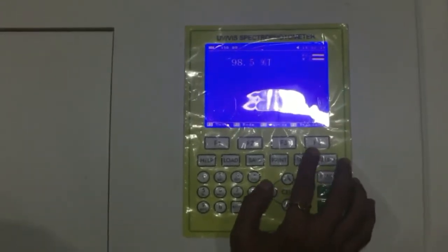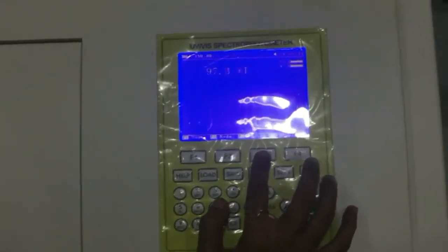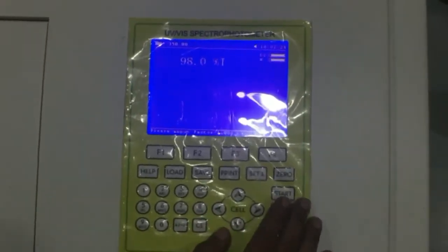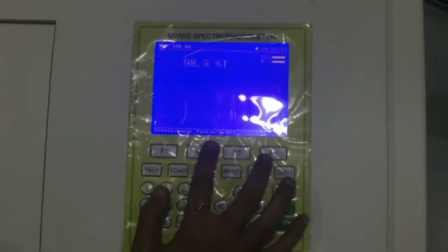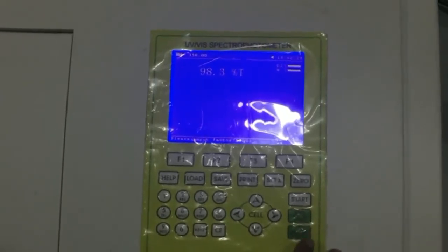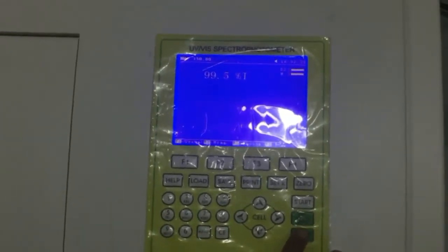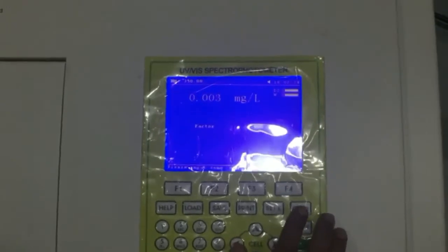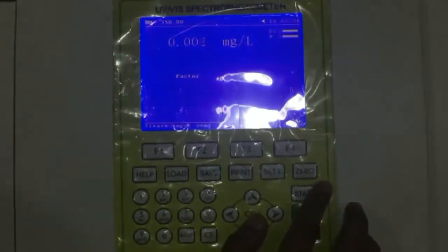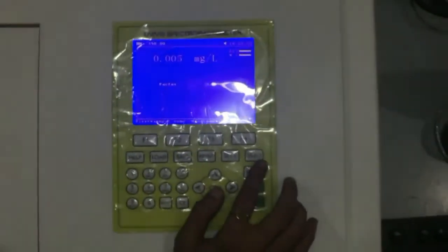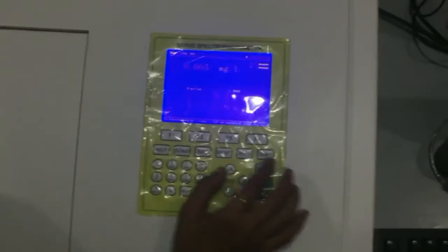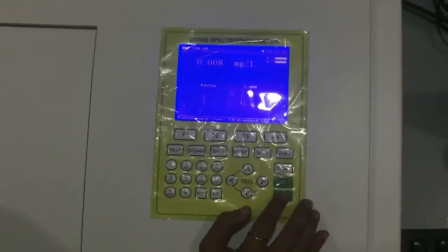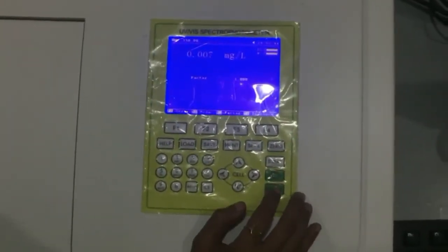For selecting the factor, press F3. After selecting the particular factor — which is 1.0 right now — press enter. For selecting the standard, press F4, where you can set the standard as per your method. Press enter.